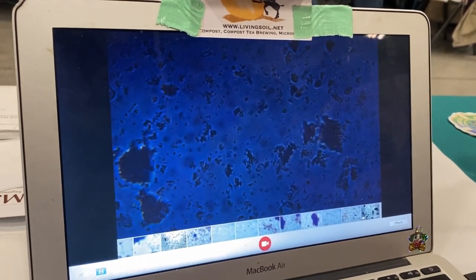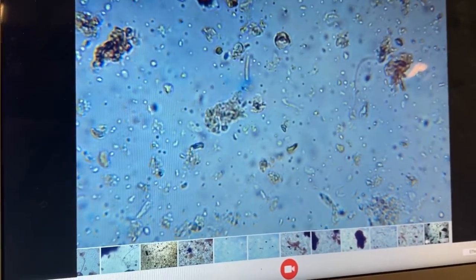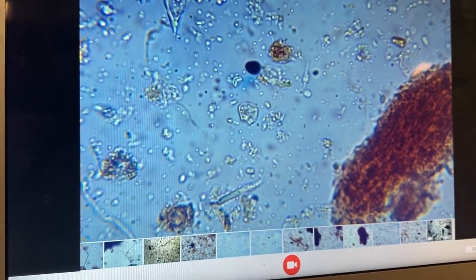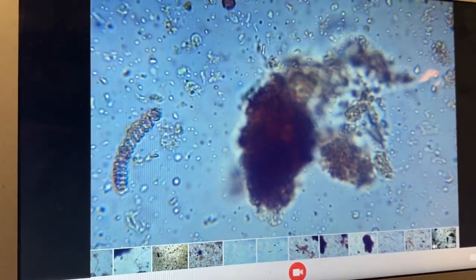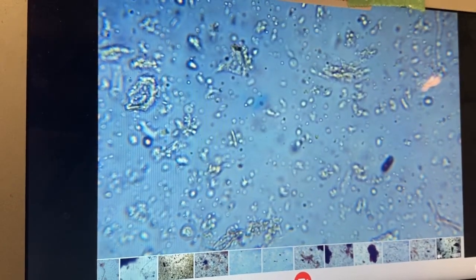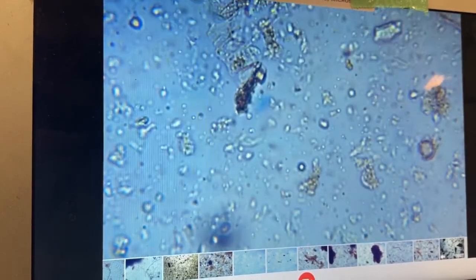Get it good and in suspension, into a slurry — maybe use a paint stirrer or drill. Even the bacterial populations in this sample are so much lower than the other stuff, which tells Zach there was just a more balanced ration of what this pile was built from. There's a chunk of things humifying, and a fungal spore. I asked Zach: in a Johnson-Su, is it more important to have finer chipped wood chips than with thermal composting? He said no — he'd want the chips at least an inch in size.